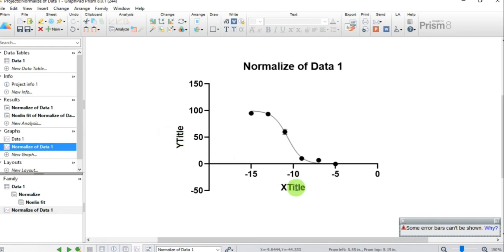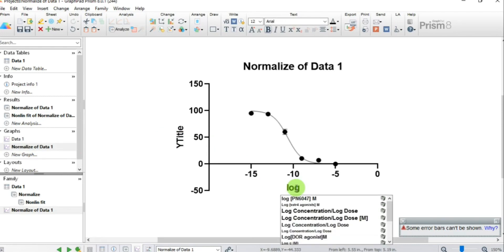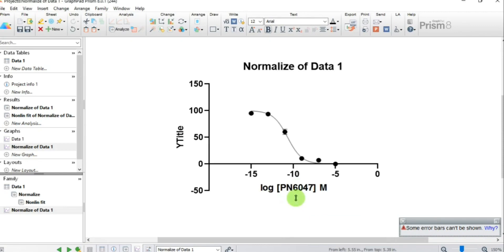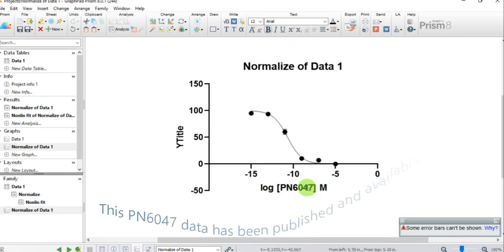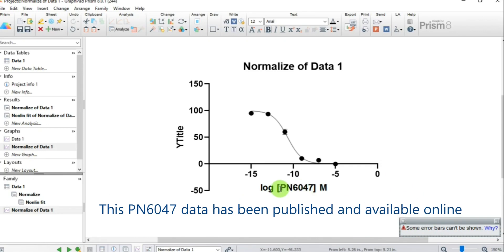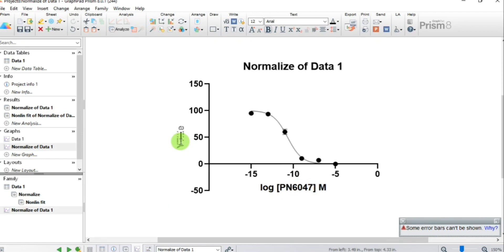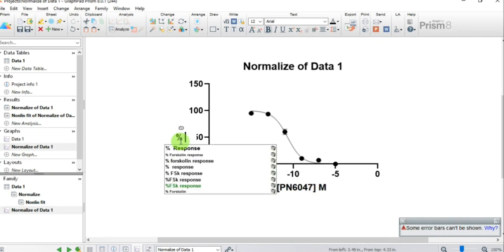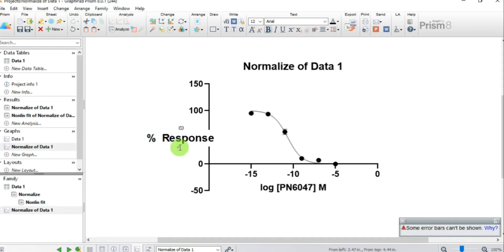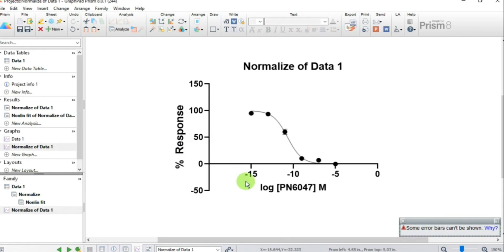First let's change the axis titles. For the X-axis, type "Log [PN6047] Molar Concentration" — PN6047 is a novel analgesic compound that I researched during my lab experiments. For the Y-axis, change it to "Percent Response".